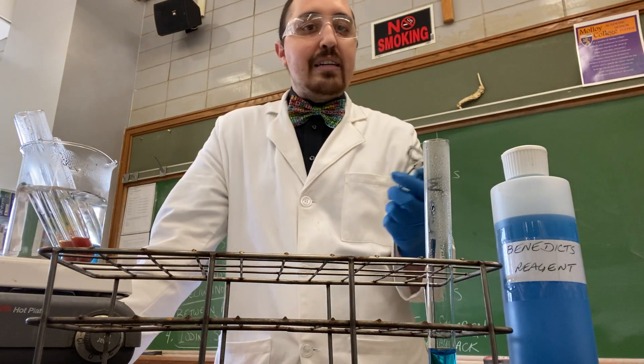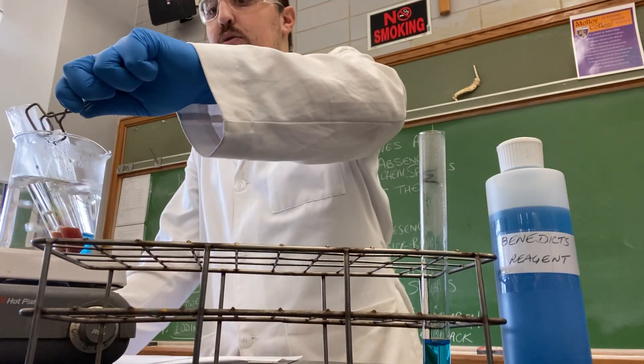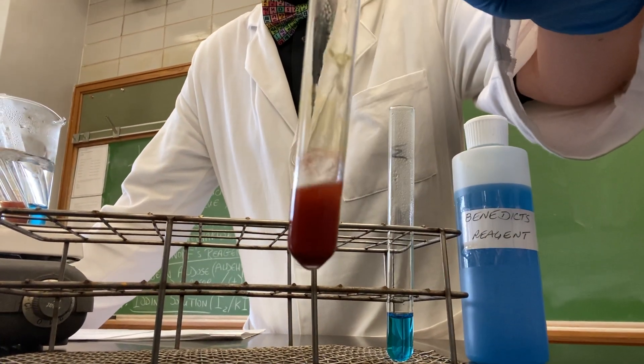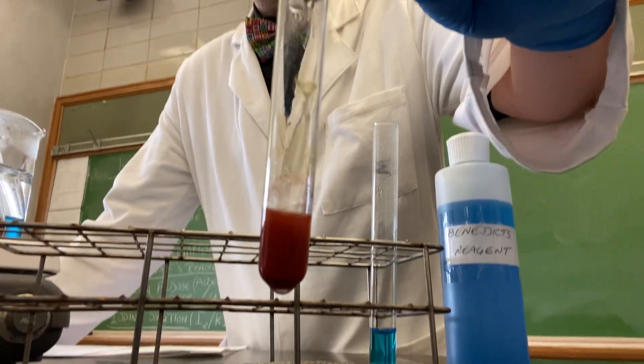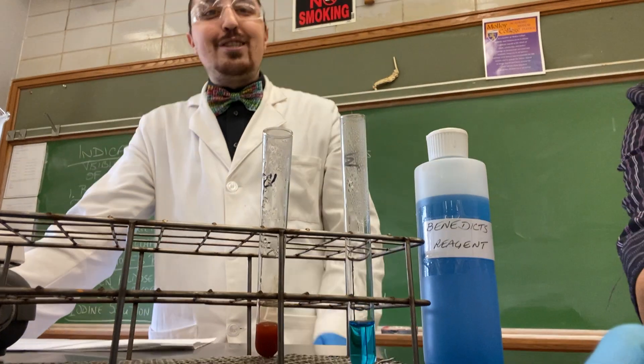Next we're going to check out the monosaccharide glucose. We grab glucose and notice that the solution has turned a brick red color, indicating a positive test for reducing sugars.